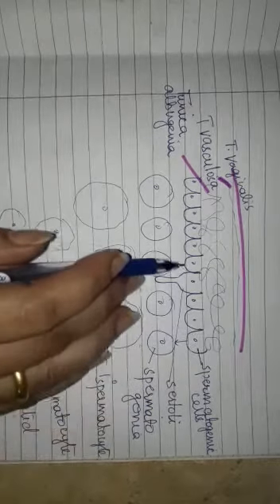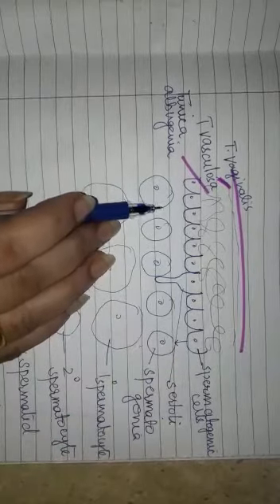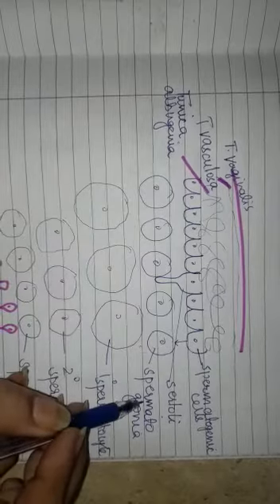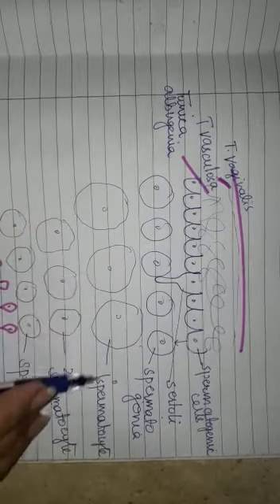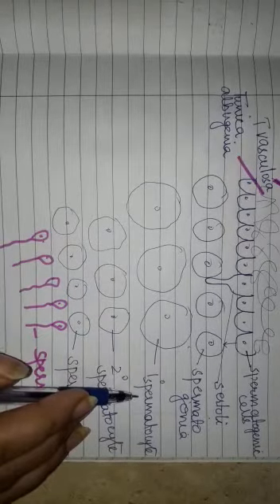These smaller cells of germinal epithelium divide mitotically and they produce spermatogonia. Then they enlarge in size and they become primary spermatocyte. Primary spermatocyte undergoes meiosis.